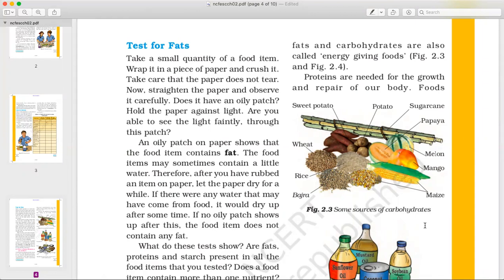If there is an oily patch, it means that the food item contains fat. Note that the food item may contain a little water, so after rubbing the item on the paper, let the paper dry for a while. After it dries, you will be able to see the oily patch clearly, which indicates the presence of fat.